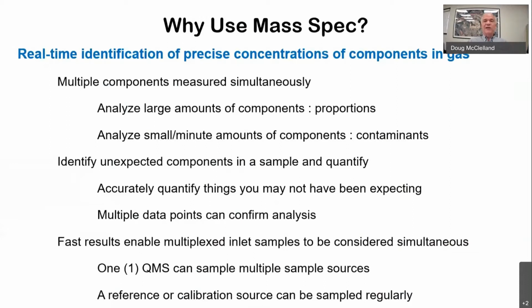that are in there. So we're accurately able to see these unexpected things, and we're able to use measurements of one element to confirm the total mixture. For instance, if I'm looking at a gas from a cylinder of room air, that typically will not have argon in it. But if I'm sampling my room air, I'll see that 1% argon. So I can kind of use these other measurements to confirm, was that sample from room air or was it from a synthetic cylinder.